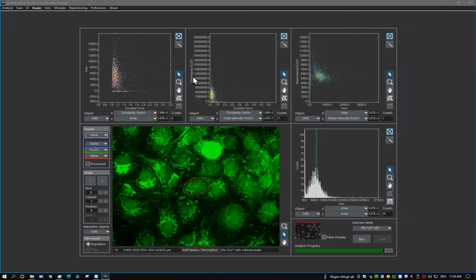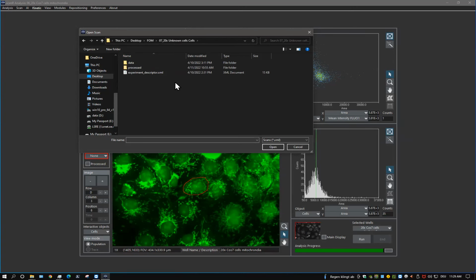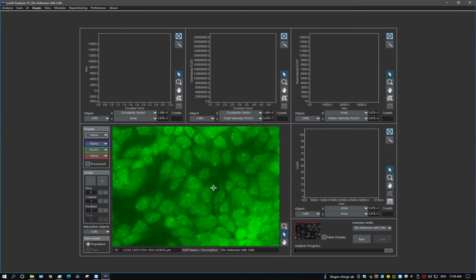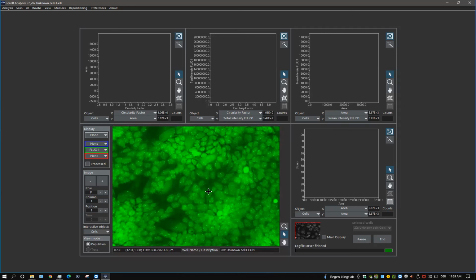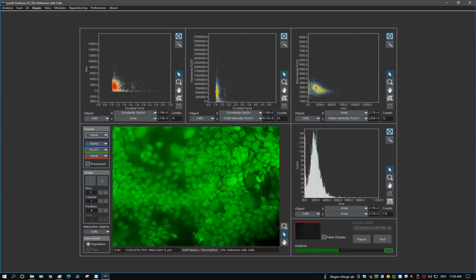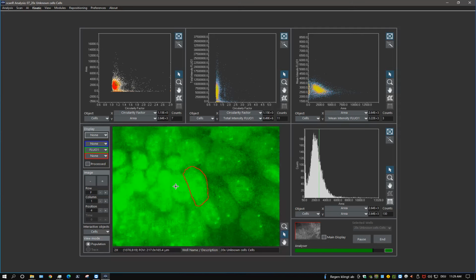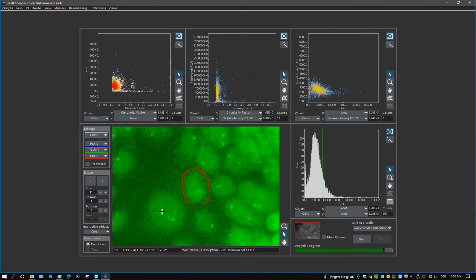Let's look at another example. I picked this one because it's a really bad image quality. There were reasons to acquire it with this low signal. But in the end, we have now the task to segment the cells here, it's a cell line which I don't know. But from the image analysis point of view, it's really challenging. And it does not do a perfect job here. So there is no perfect solution to this, but it does a decent job. It will give the best probability or the best prediction.